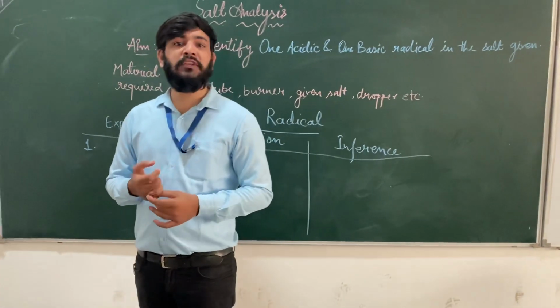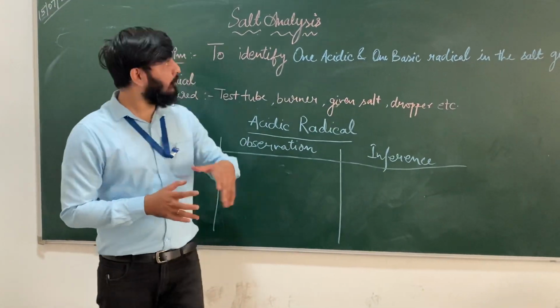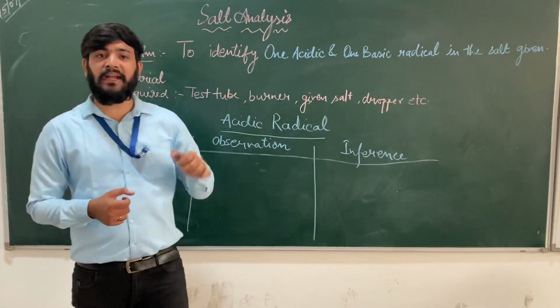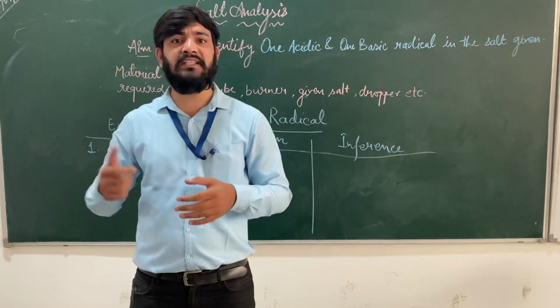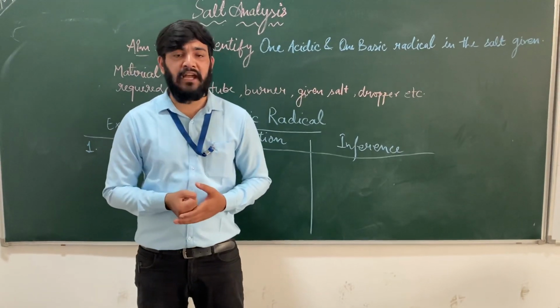Let us start with the practicals of chemistry. Today, I'm going to start with salt analysis. Salt is comprised of two parts, as we all know. One is your acidic part and second is your basic part. Acidic part means anions and basic part means cations.